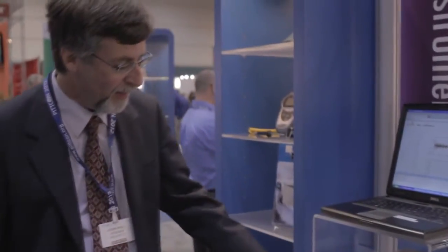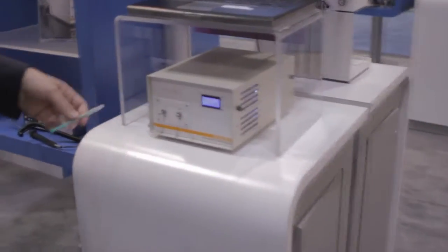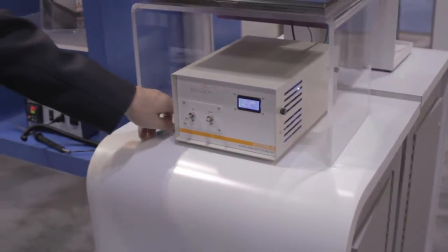On the front panel there's an inlet. You inject a sample. A normal way to put a sample into it is just to use a syringe. 20 microliters is what it takes to fill it.